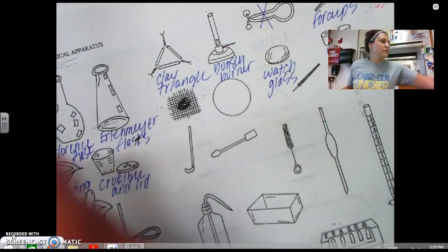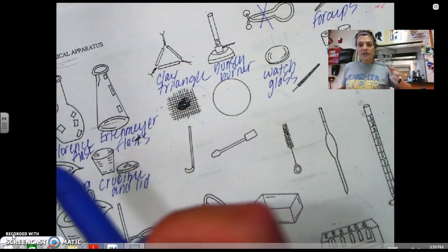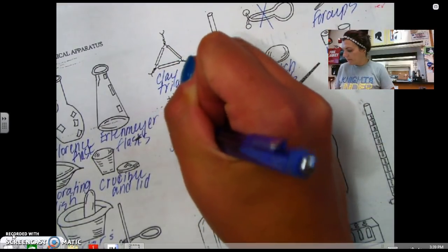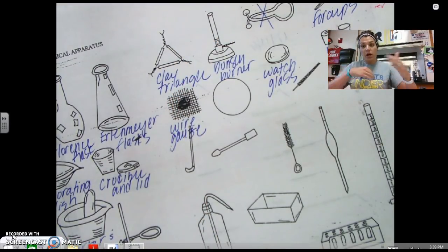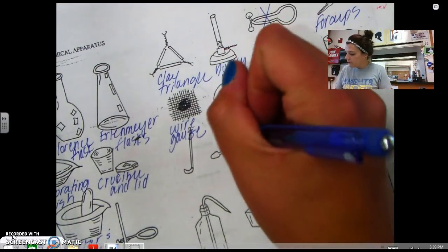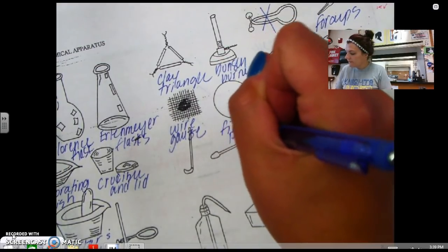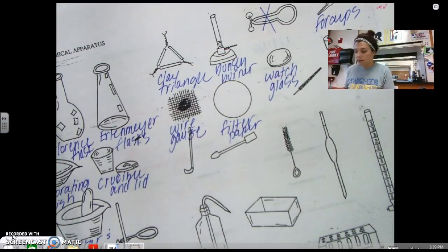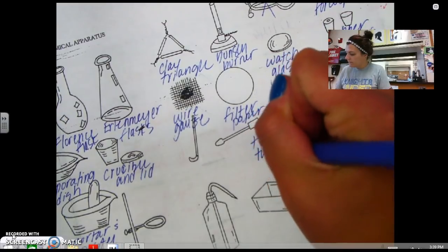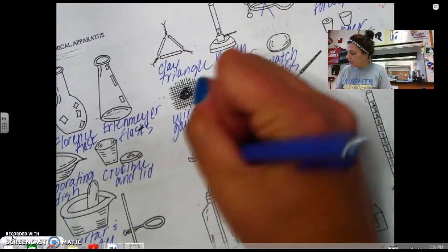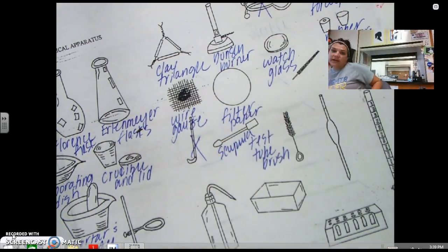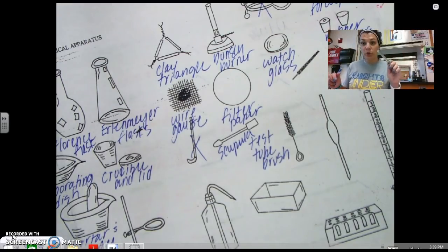This guy I just showed you. This is the wire gauze with ceramic on it. So wire gauze. That's what we put on top of our iron ring so we could heat up water in our beaker. This is filter paper. Obviously, filter paper is going to help us separate liquids and solids. Test tube brush. We can skip this. This is a scoopula. Another one of my favorite things. It's used for a spoon. Scoopula.